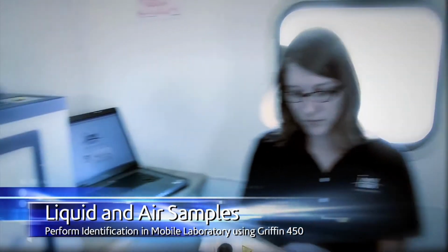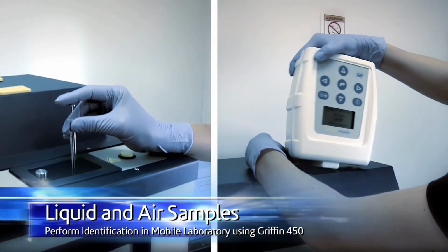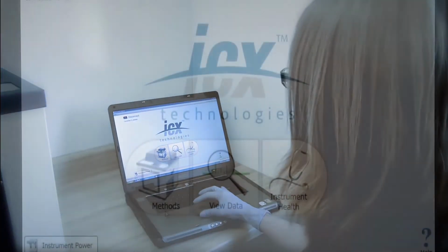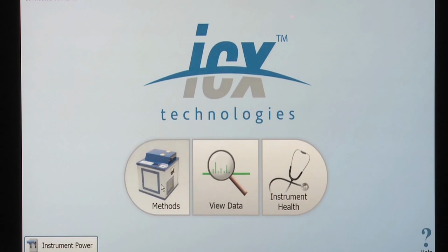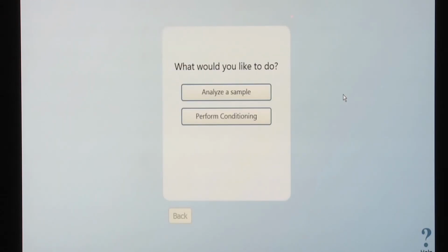But they can sometimes even get drug vapors off of there. And here's a mobile lab system. You can see that on the left, you can just do a traditional injection also. They even make an auto sampler for this instrument. And with all these technologies, when you're going to make it deployable and give it to non-scientists, you need to have nice, simple software like this.